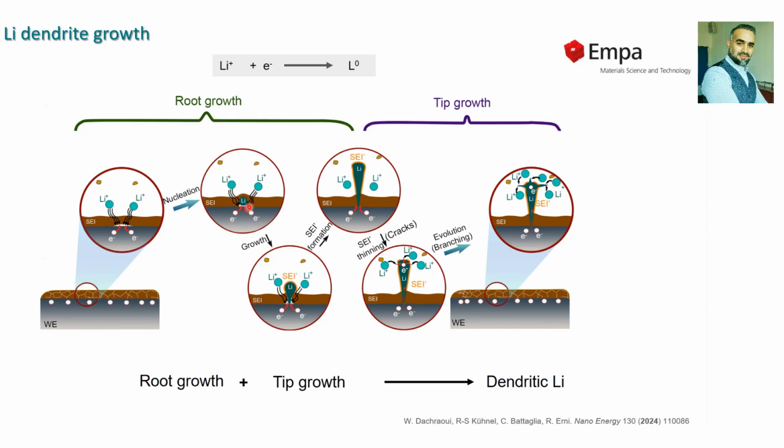with continued plating, and then the lithium metal will start depositing beneath these nanoparticles, pushing them away to the electrolyte, and the SEI is protecting these lithium dendrites until cracks form after a stretching of this solid electrolyte interface.